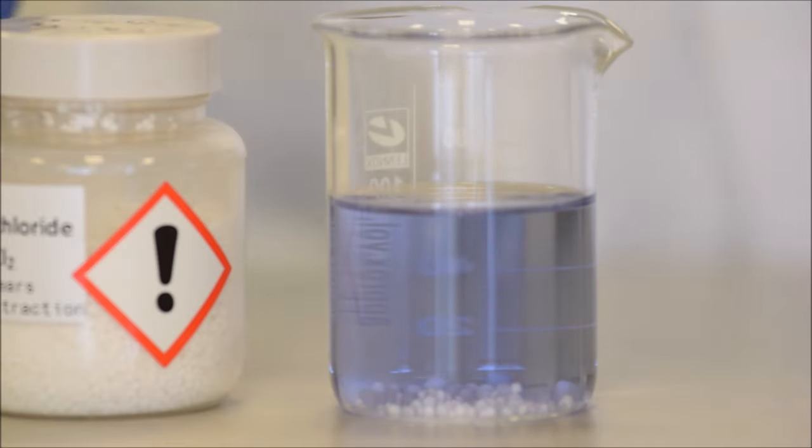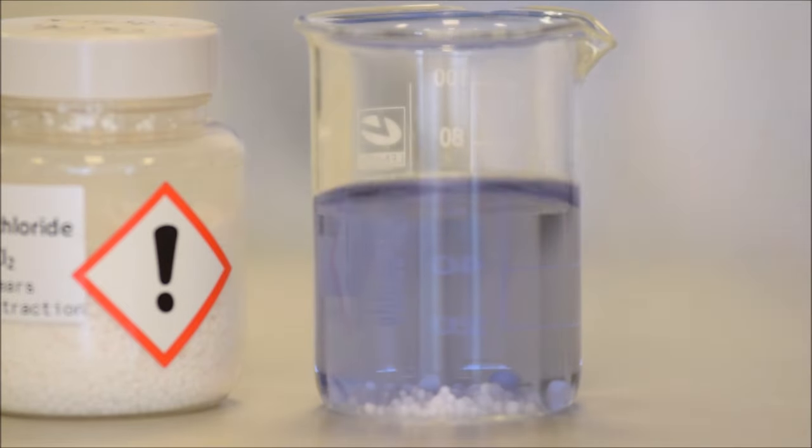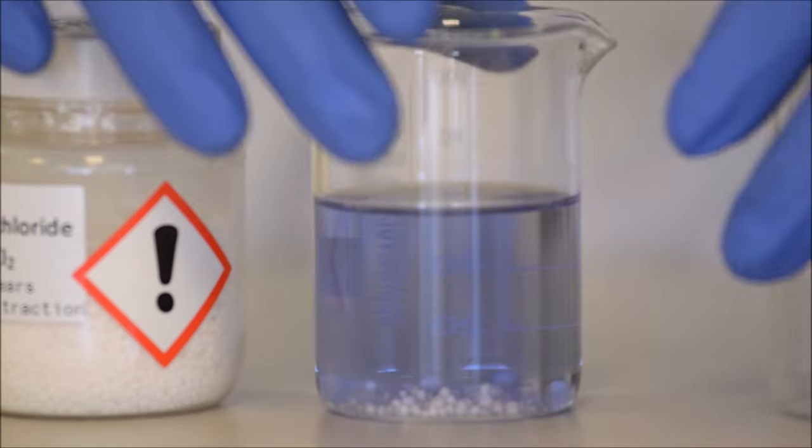And once you've waited, then what you want to do is leave that solid behind. So another quick shake, and we're just going to leave that solid behind. And the solid now has all the water that was in the organic solvent. We're going to leave that solid behind by decanting. And decanting is just a fancy way of saying pouring off and leaving the solids at the bottom. So that's exactly what we're going to do now.